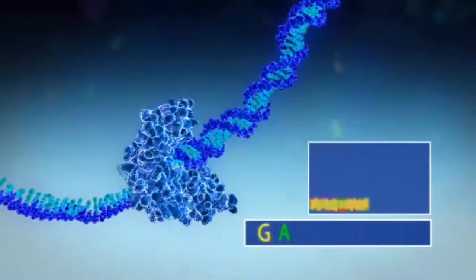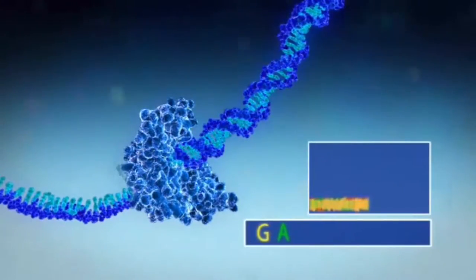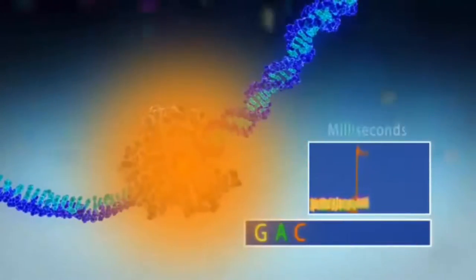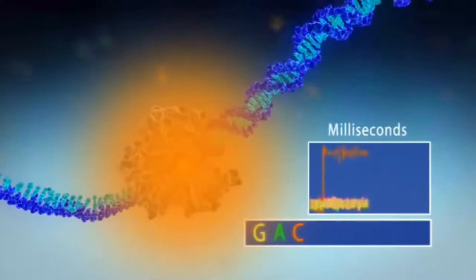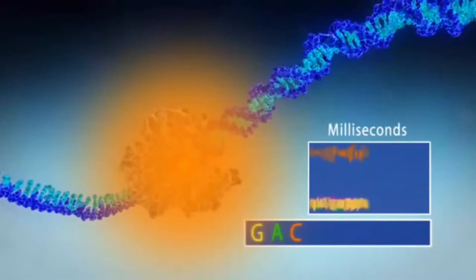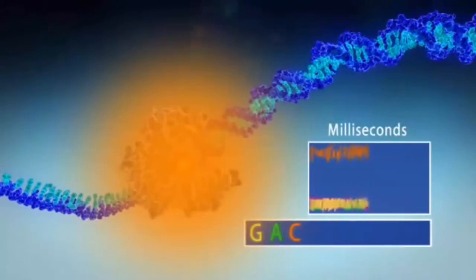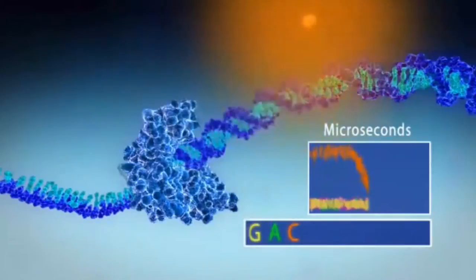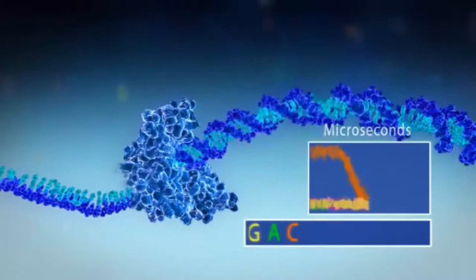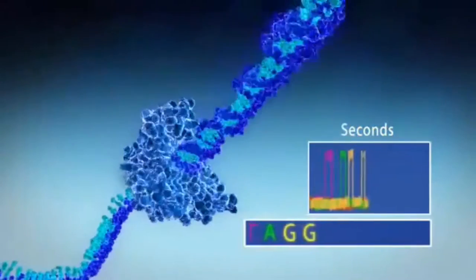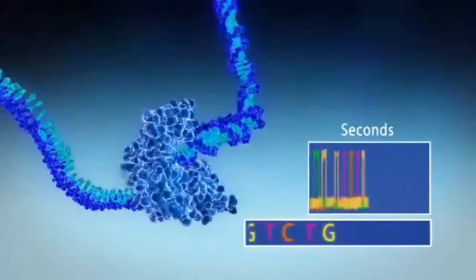Nucleotides diffuse in and out of the ZMW in microseconds. When the polymerase encounters the correct nucleotide, it takes several milliseconds to incorporate it, during which time its fluorescent label is excited, emitting light that's captured by a sensitive detector. After incorporation, the label is clipped off and diffuses away. The whole process repeats, creating sequential bursts of light corresponding to the different nucleotides. These are recorded, thus building the DNA sequence.